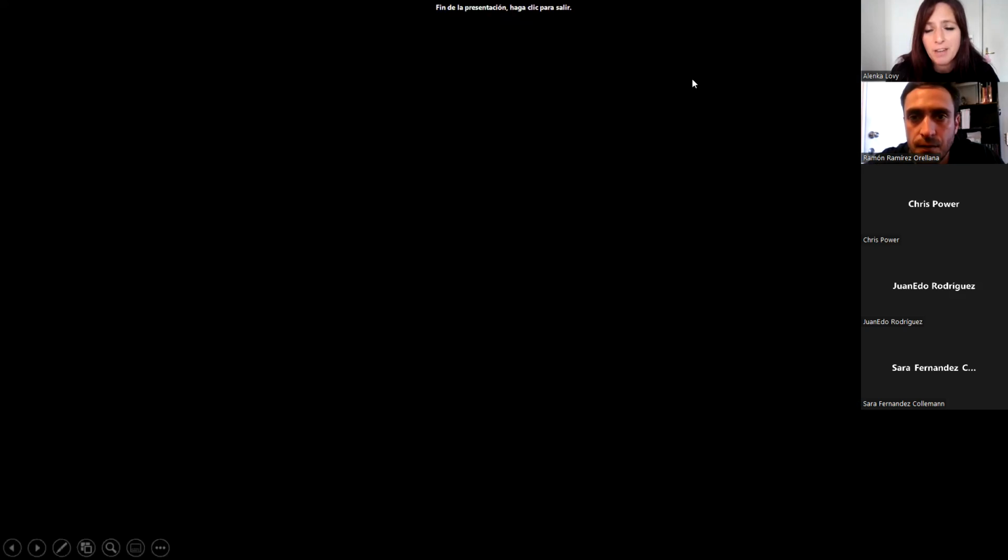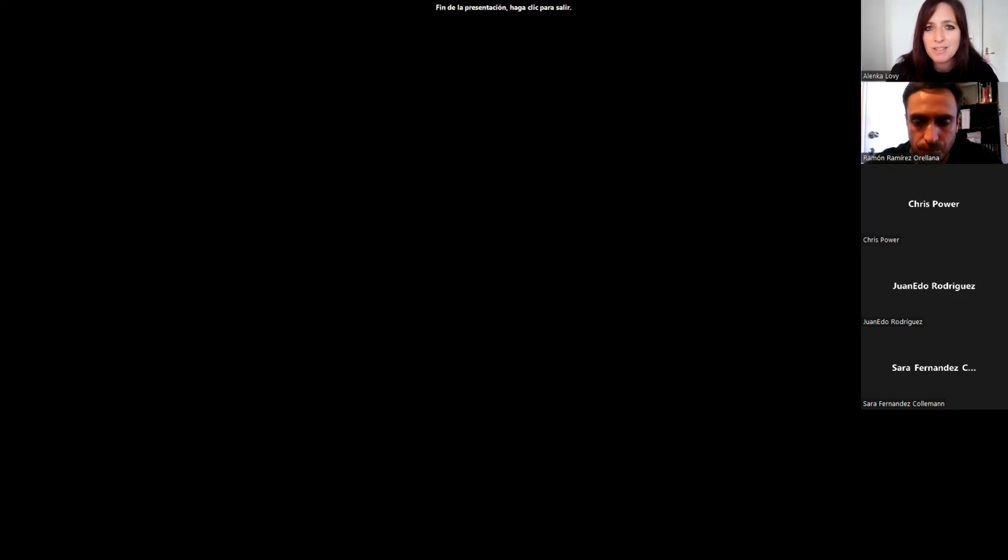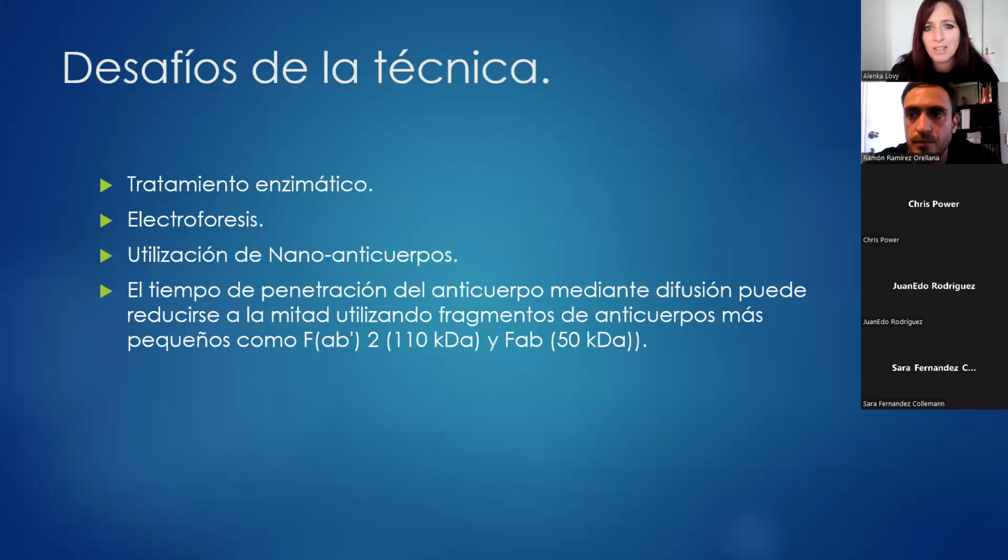And if everybody will be bringing a sample, we might have to stagger how we use the Clarity equipment. So probably 5 or so people can process their samples at a time, and it takes about a week. So we'll have to sort of stagger how we do it. But please do sign up so we can check your samples out.